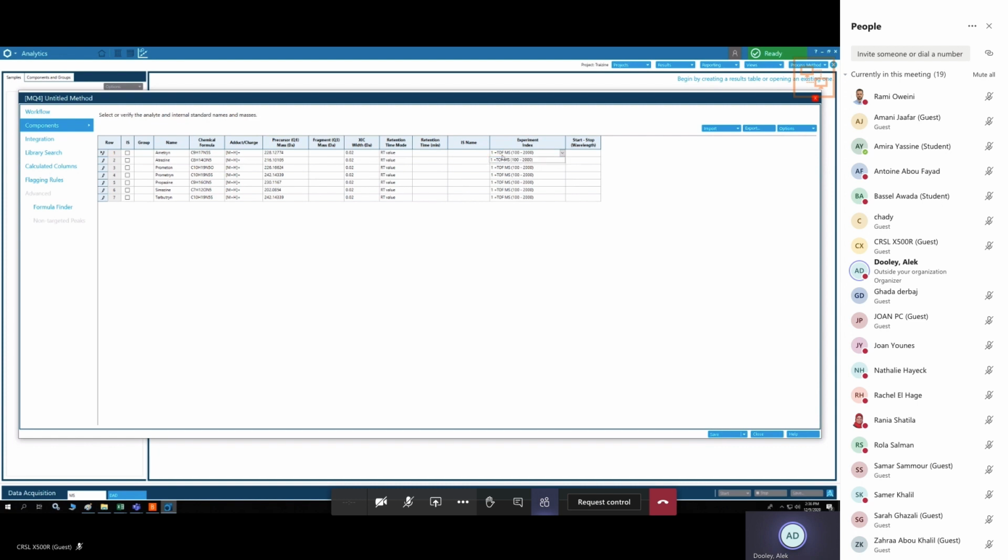And pretty much you will always have the TOF-MS here. So we will use the TOF-MS as the survey scan to find the XIC, and only the MSMS data will come from the IDA. I think you can't even change it, because it knows it cannot look for parents in the IDA data. It can only look for the parents in the TOF-MS data.